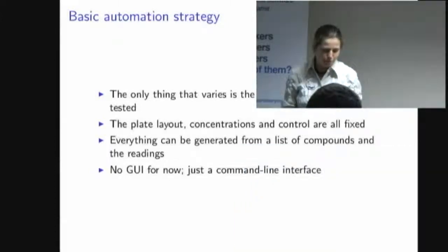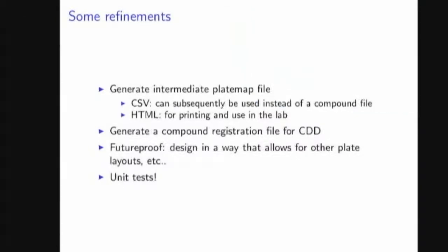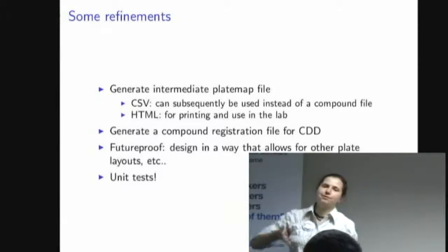And so to make the first script, we decided not to make a GUI or anything complicated, just a simple command line interface, mostly as a proof of concept that this would work. And as I went along, I introduced various refinements to the initial idea. So that plate map file that I showed you with the metadata, the script also generates that as an intermediate format. So the researcher can generate that plate map file once and then use that later instead of the compounds.